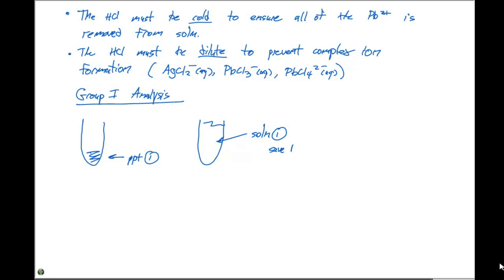We're gonna save this for a later test. And I should point out that the unknown you're gonna get in your particular experiment only contains group one, group two, and group three cations. So this solution number one contains cations that are in group two and group three. Our precipitate down here is gonna contain our group one cations.